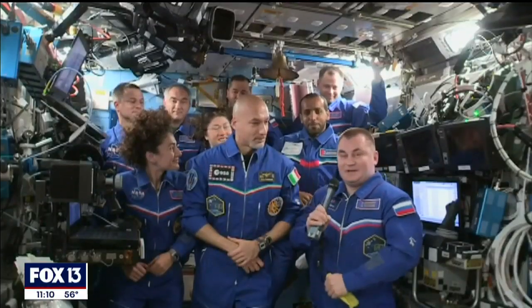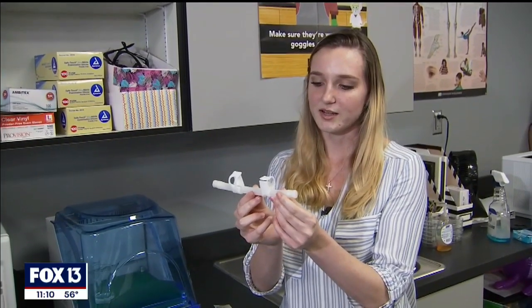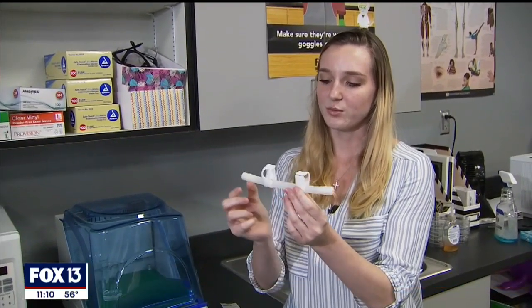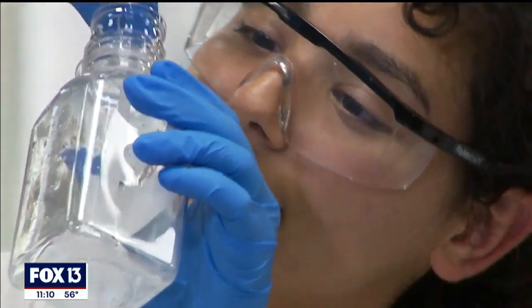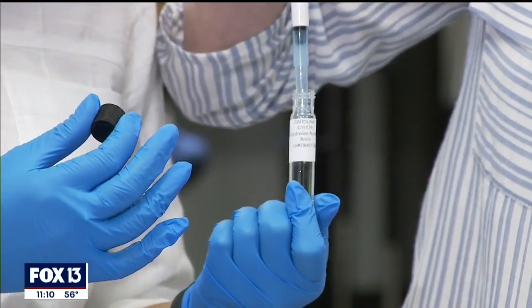The astronauts will run the experiment up in space. So they open one of the clamps and the bacteria will rehydrate in the broth, and then we have amoxicillin in another clamp. While students carry out an identical experiment on Earth. We are assuming that the microgravity will not affect how it grows. We're assuming that the bacteria will still not grow, the antibiotic will still kill it.